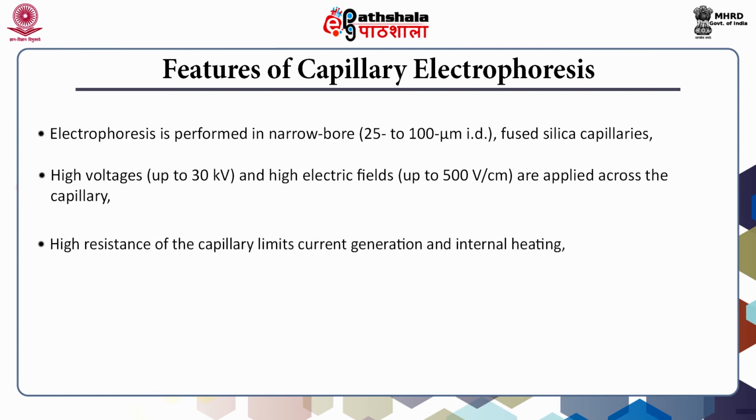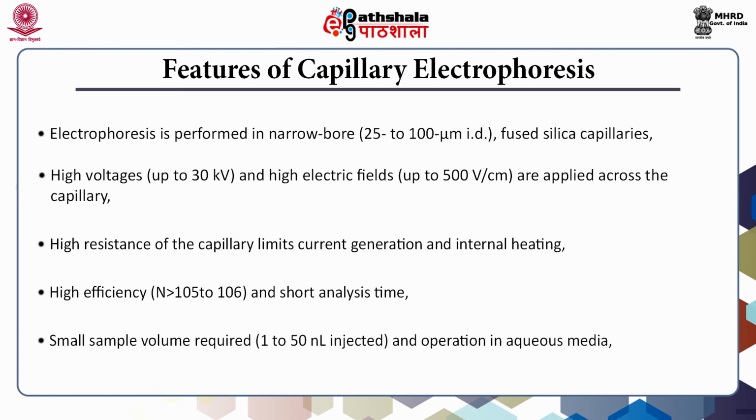High resistance of the capillary limits current generation and internal heating. The number of theoretical plates is very large, in the range of 10 to the power 5 to 10 to the power 6. Analysis time is short. A small sample volume is required, in the range of 1 to 50 nanoliter.